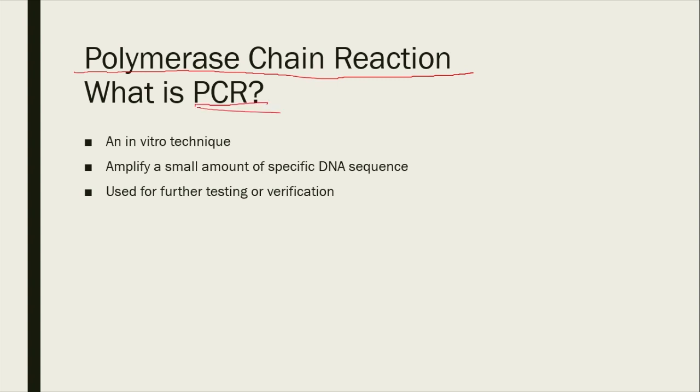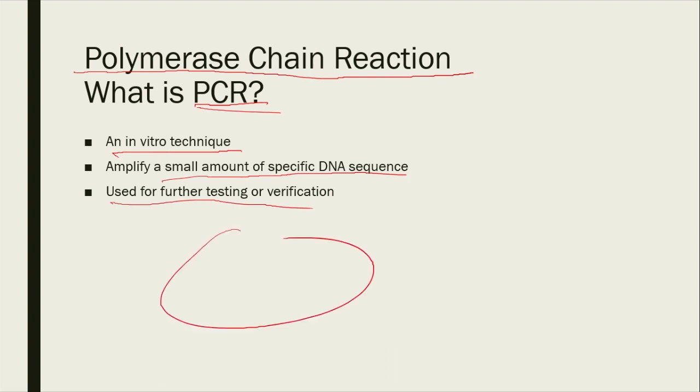You may have learned about it some time ago. If you have a richer background, such as a bachelor's degree, you're probably quite familiar with this term. So it is an in vitro technique, and it amplifies a small amount of specific DNA sequence used for further testing and verification. In our case, in our introduction, it is to verify our inserted gene.